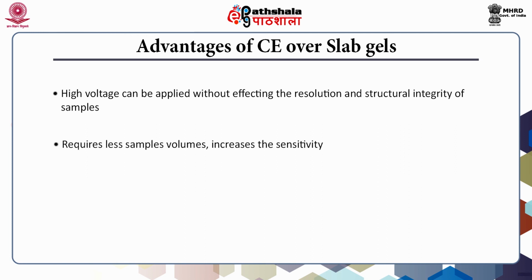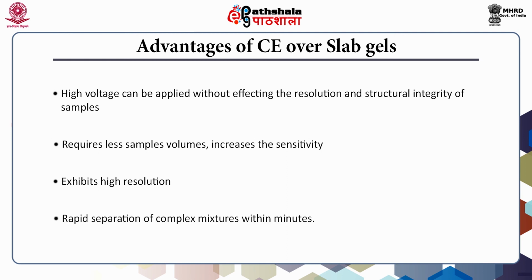Capillary electrophoresis requires less sample volume and therefore it results in enhanced sensitivity. Capillary gel electrophoresis exhibits high resolution. It can even separate chiral mixtures. It separates complex mixtures within minutes. This technique is known for its rapidity.